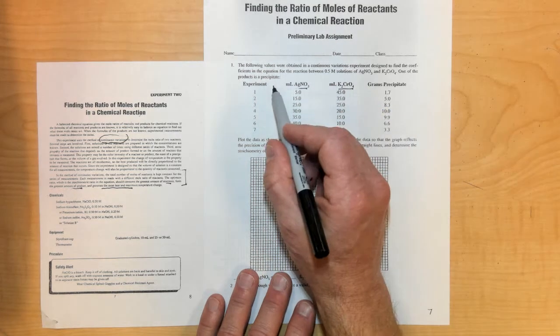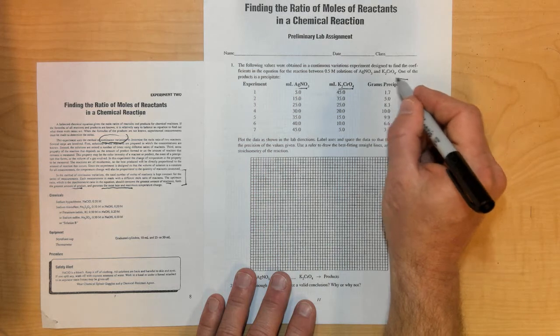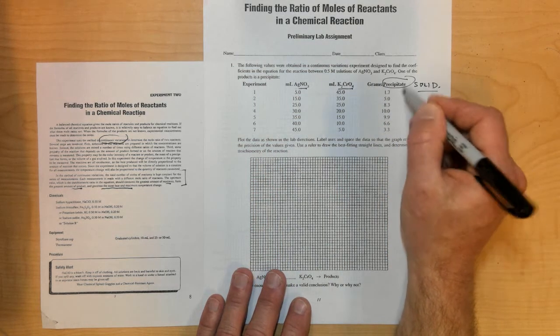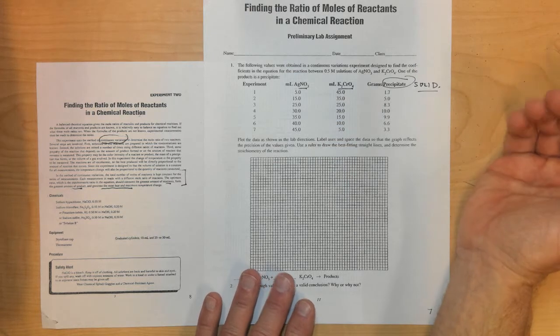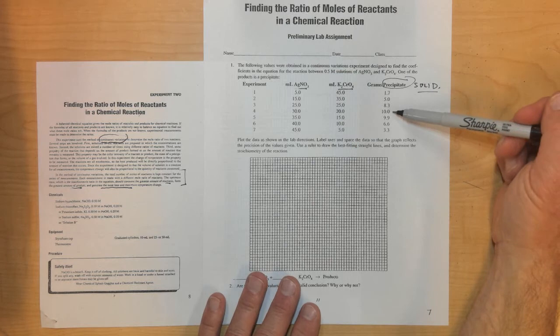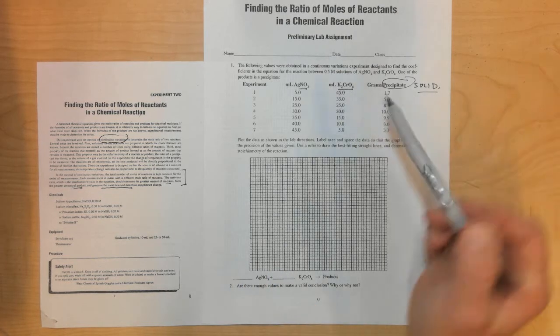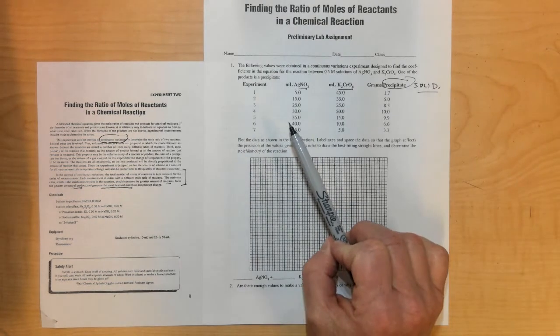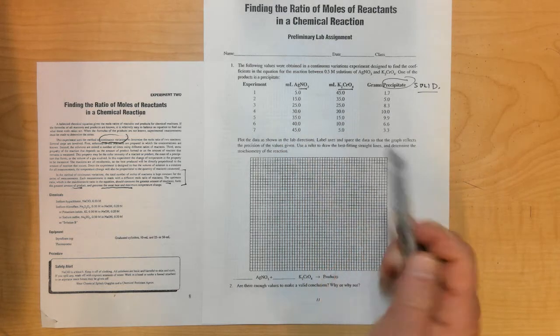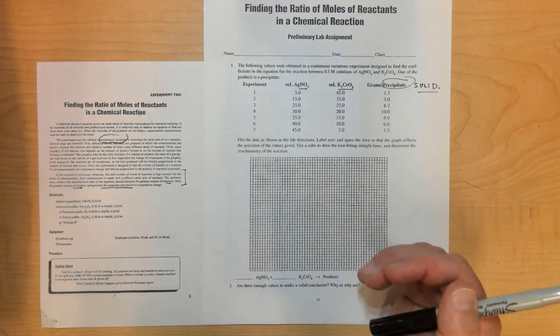One of the products forms a precipitate, and a precipitate is simply a solid that's formed, and then they measured the mass of the solid that forms. And of course, when you have the greatest amount of solid that forms, hopefully that's where the largest amount of each reactant is used up, and both of them limit or are used up.